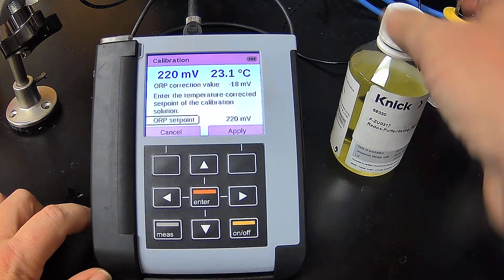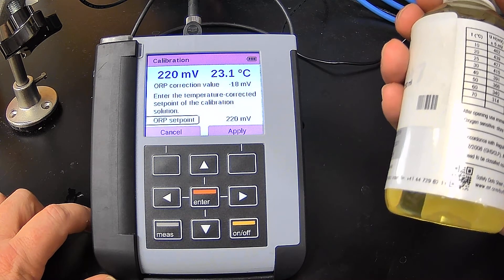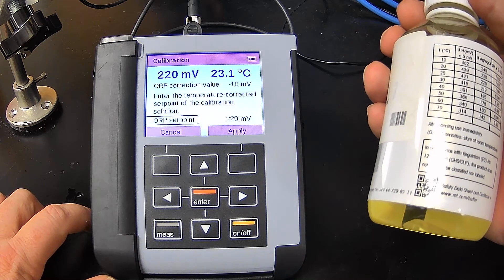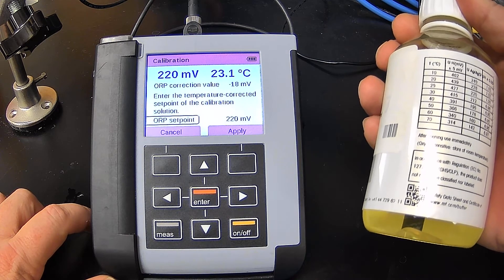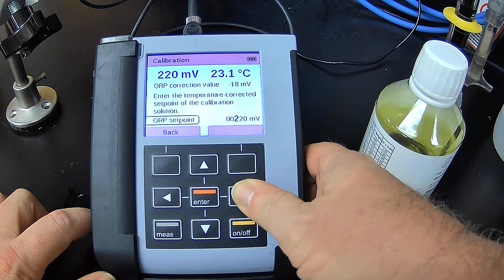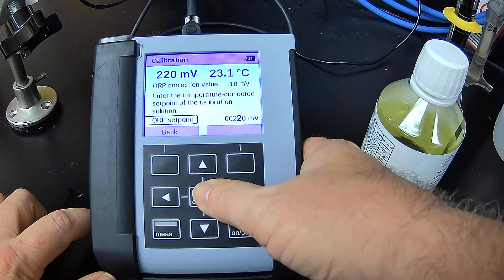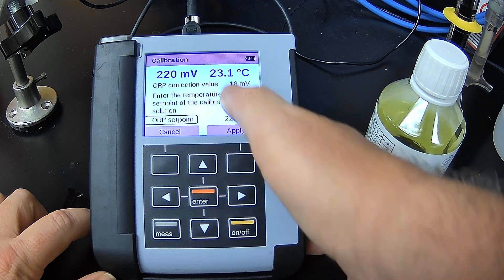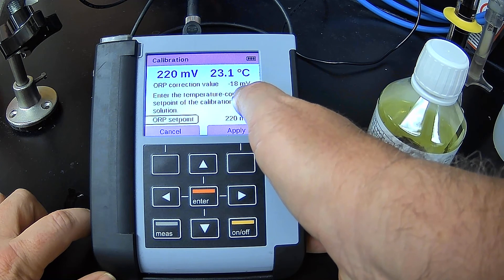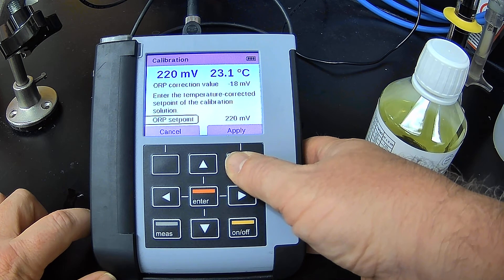So now I'm going to tell it at 23 degrees Celsius. Actually, we're between 20 and 25. So I'm going to tell it that it is 220 millivolts, which we already have. But if I wanted to change it, I could do that. So I hit enter. Okay. My correction value is going to be negative 18 millivolts based on the reading. I hit apply.